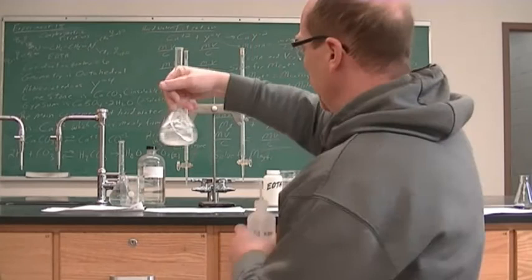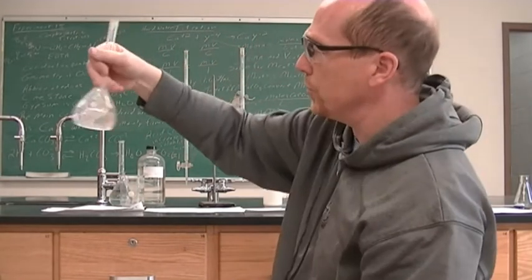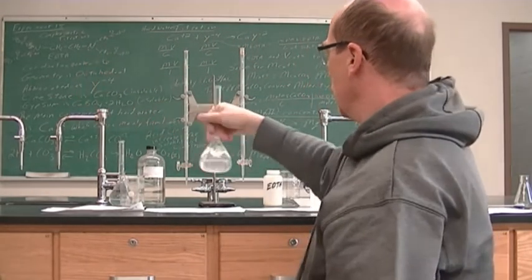Still have quite a bit of solid in there that needs to dissolve.